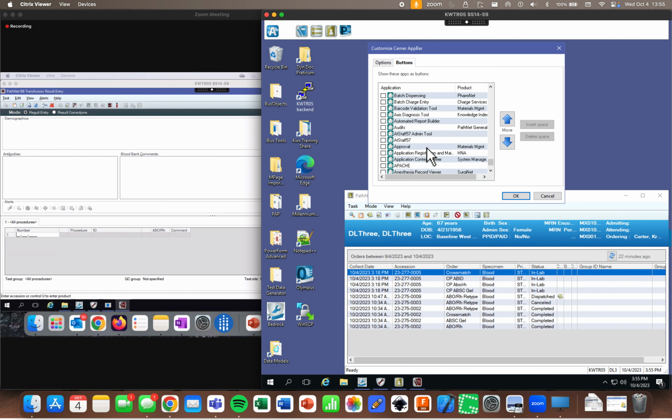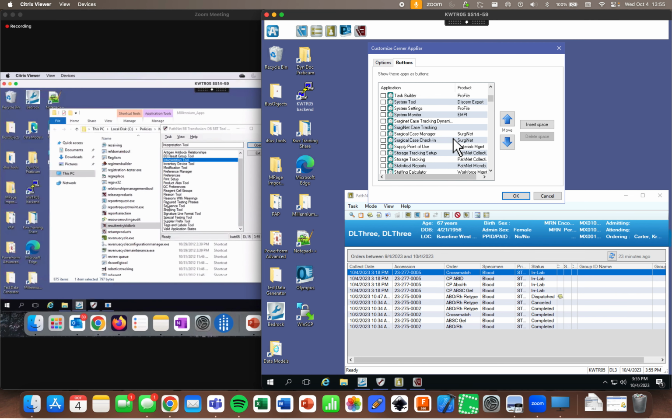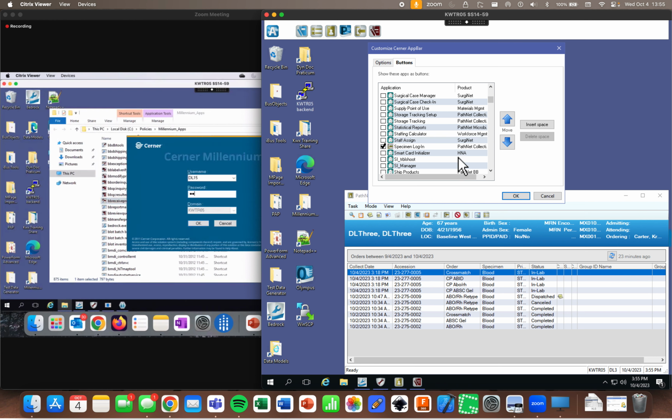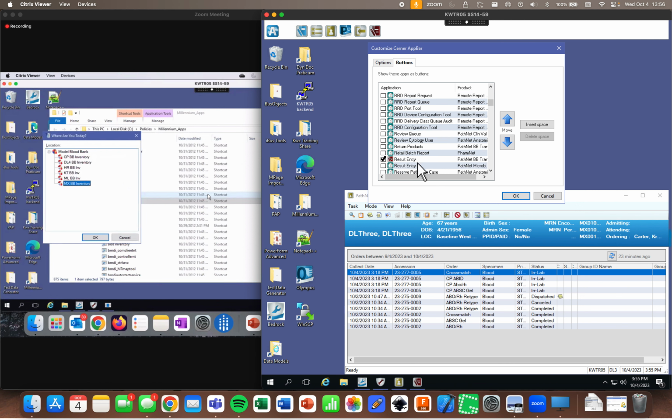Nope. Okay. Then we are going to real quick finish up the last part of this, which is just to do a little bit of receiving of products, and then we're going to run it through a cross match. So I do not need result entry right now, so I'm just going to close that, get that out of the way. And so I want to go to BD receive products. So we've tested our orders. Now we're ready to test our product build.